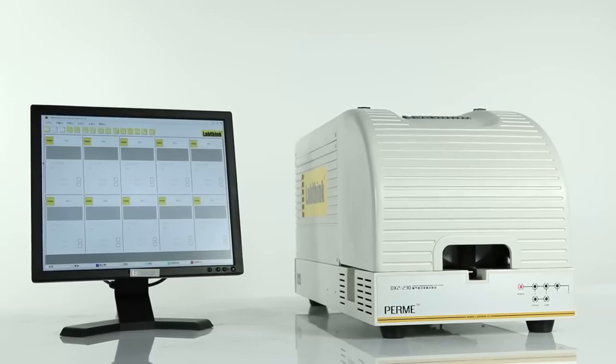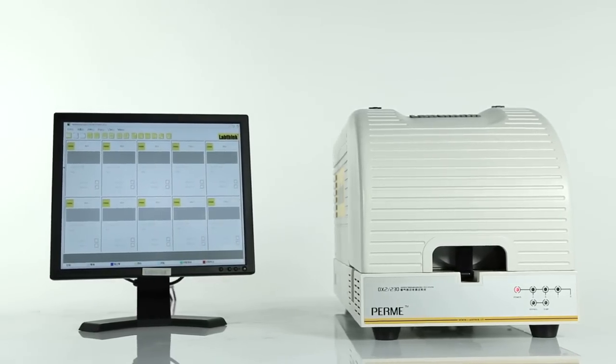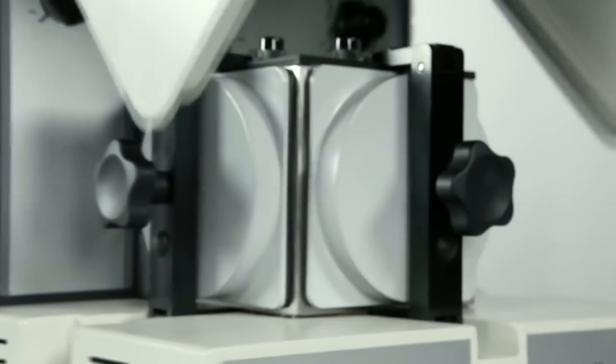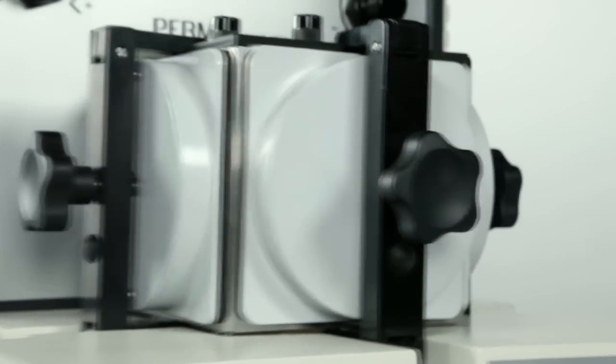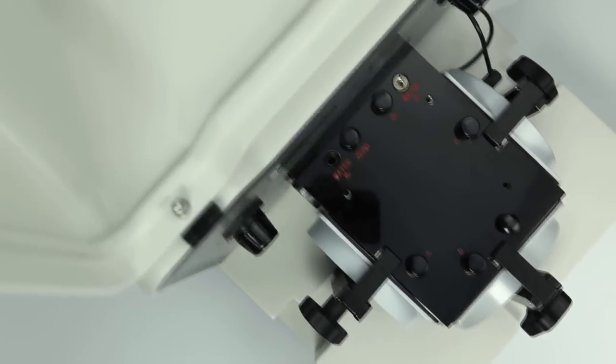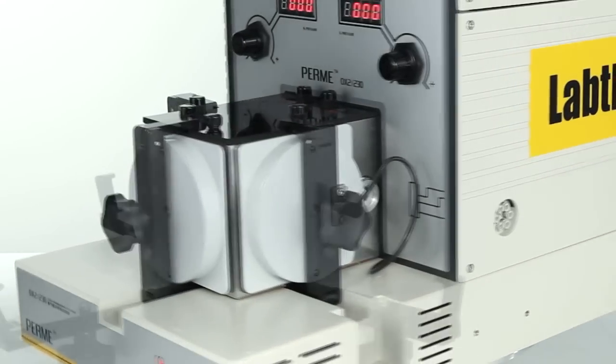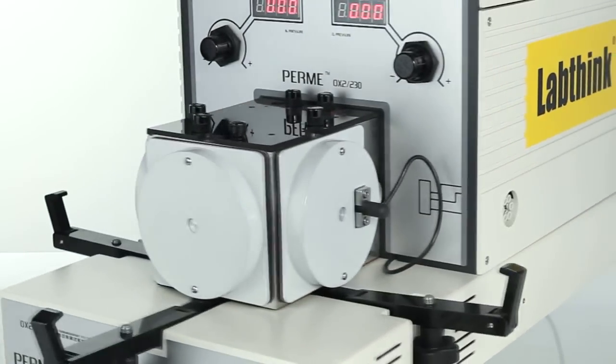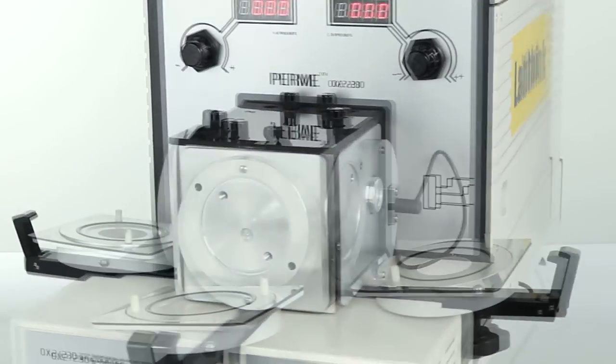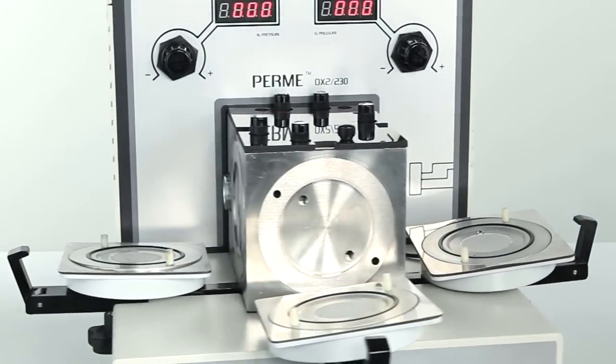OX2230 is LabThink's latest generation of automatic OTR testing system, which is the only one applying for the design patent of integrated test unit with three vertical chambers in the world.